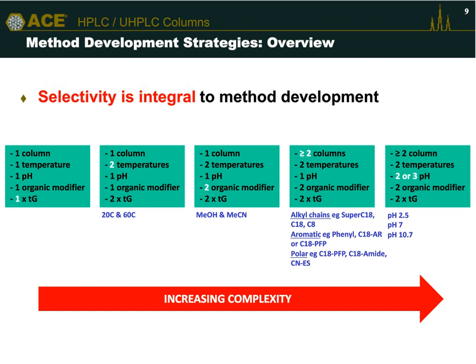Now, as we move from the left-hand side of the slide to the right-hand side of the slide, we do more injections, we generate more data, it takes more time, but we generate more knowledge as well. Now, rarely do we have the opportunity to explore all of these parameters to get a complete understanding of the retention behavior of our analytes in the mixtures, and so we must look to rationalize those parameters accordingly. So, of course, the question is, which parameters should we focus our efforts upon?